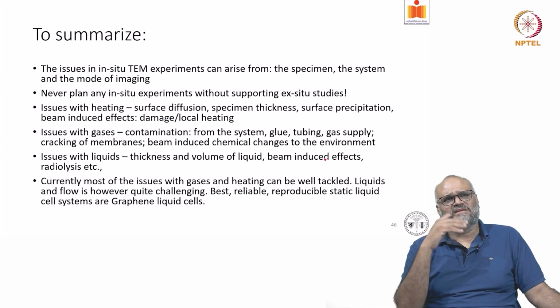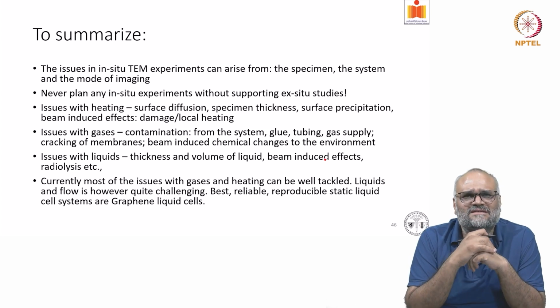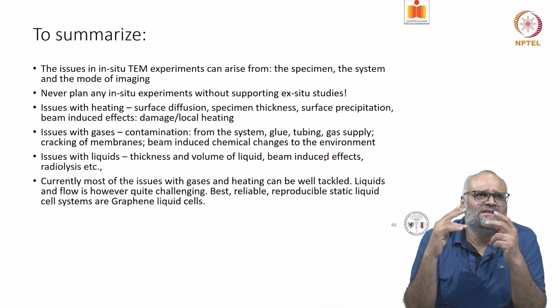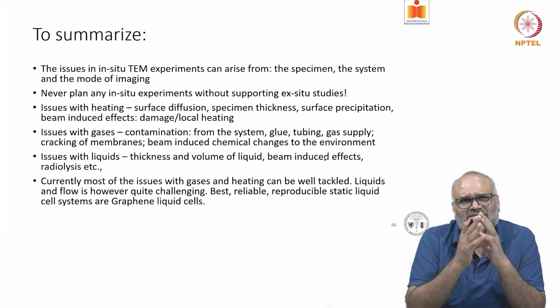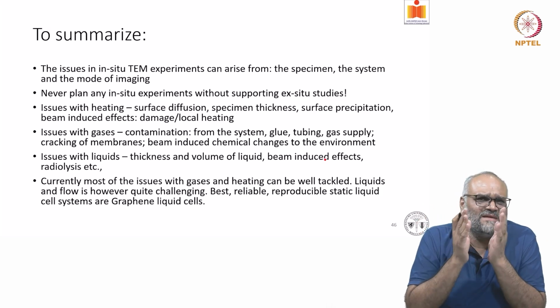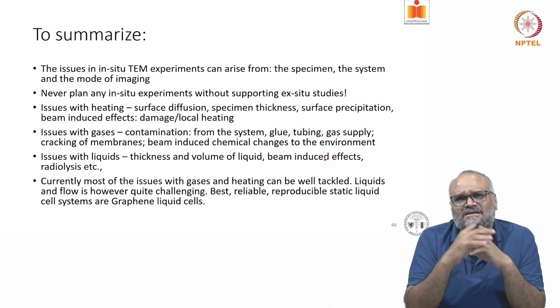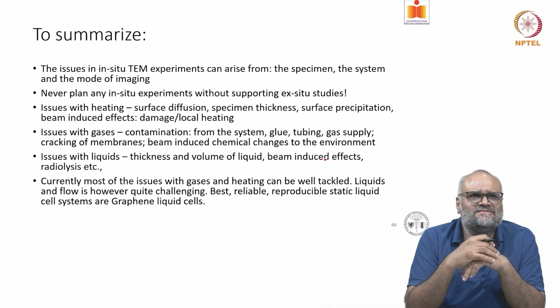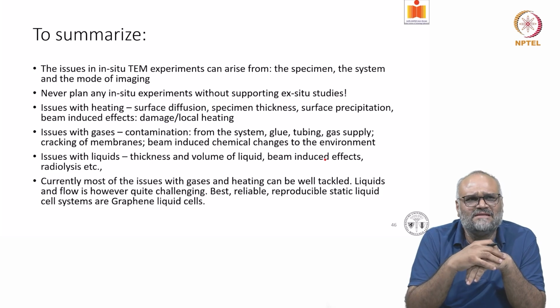And to summarize, the issues with in situ TEM experiments can arise from the specimen, the system, and the mode of imaging. Please do not plan any in situ experiments without supportive ex situ studies. The issues with heating are surface diffusion, issues pertaining to specimen thickness, surface precipitation, and beam-induced effects such as beam-induced damage or localized heating.